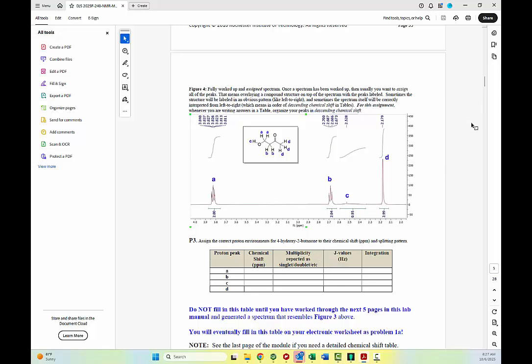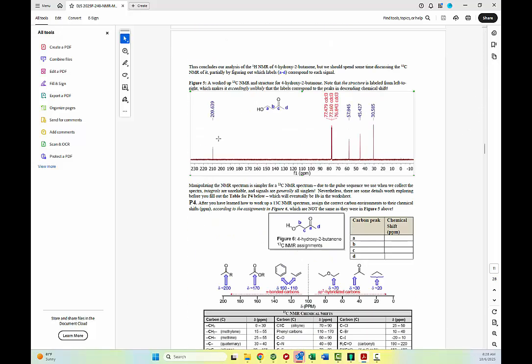By contrast, the C13 spectrum is much simpler. There are really only two tasks before you. One is to set a reference point, which either can be the CDCl3 or TMS if present. And then the second is you need to read off the location of the peaks, find the chemical shifts associated with those peaks. And then the table associated with C13 NMR is always really straightforward.